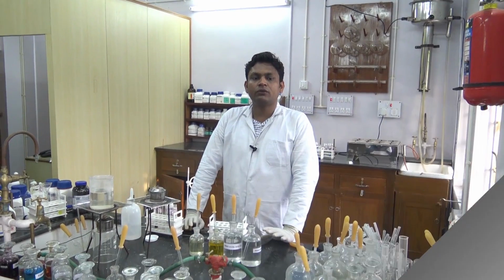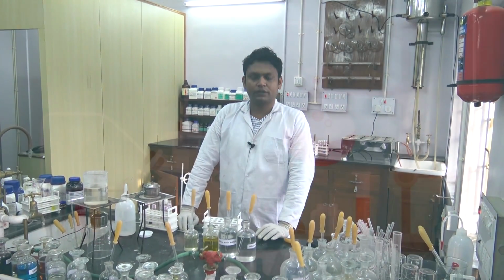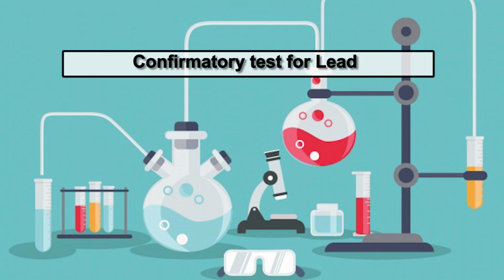Here we will show some of the selected cations, known reactions taking known samples. That will help us to detect the confirmatory reaction for cations. Now we go for the confirmatory test for some known samples. First of all, test for lead cation. This will go through 2 tests.